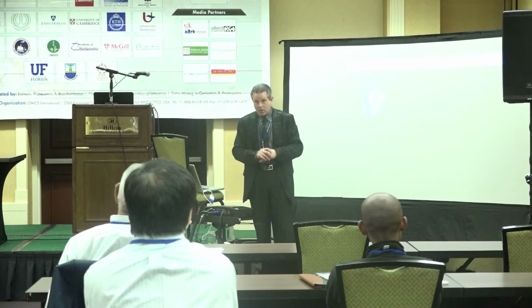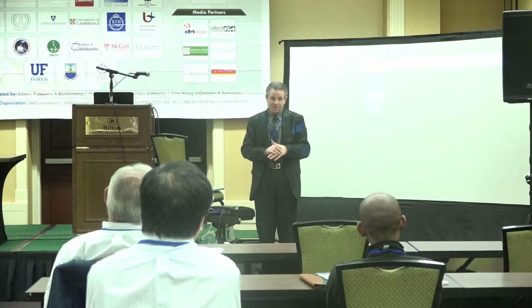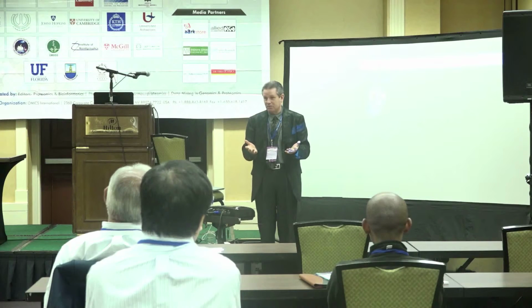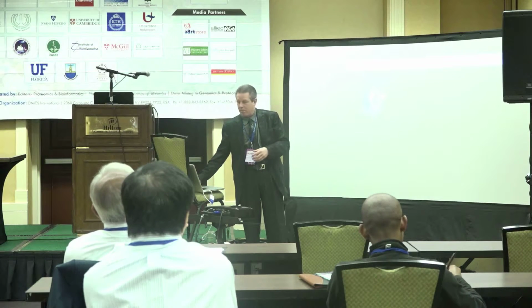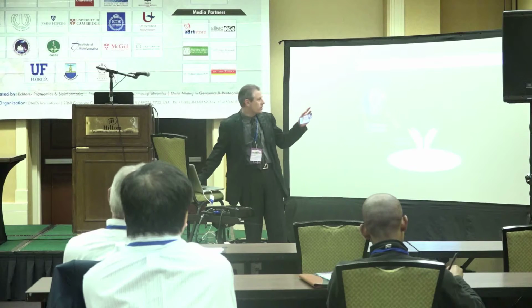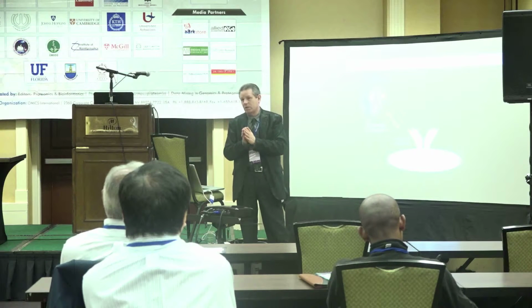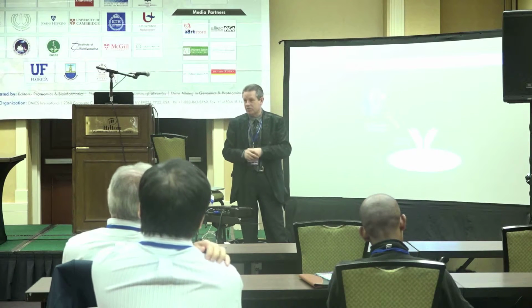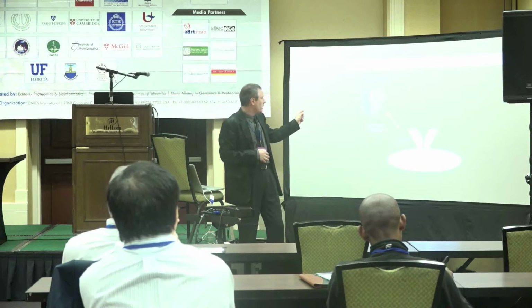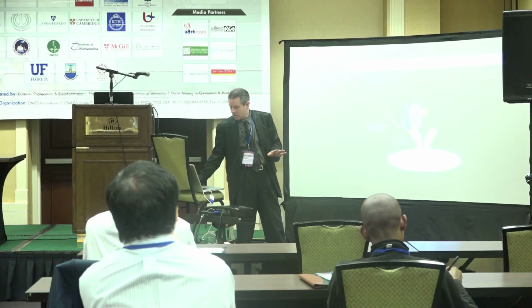Where we're going now is sandwich antibody microarrays. If you Google the terms sandwich antibody microarray, you get very few hits, largely because it's been very hard to even get antibody microarrays. So, the sandwich antibody microarray, the SAM format: we have our target protein. We don't do the chemical cleavage here because the purpose of this approach is to look at total changes in phosphorylation, so we don't want to fragment off other phosphorylation sites. So here we have our protein, and we incubate it with the array, just the crude cell lysate.